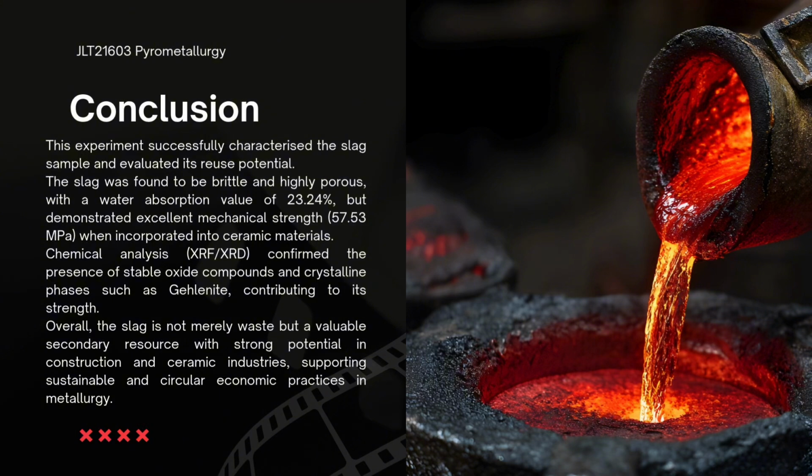However, the slag-based ceramic demonstrated high mechanical strength at 57.53 MPa. XRD analysis confirmed the presence of stable crystalline phases such as akermanite, quartz, and magnetite. Overall, slag is not simply waste, but a valuable secondary resource with strong industrial potential.